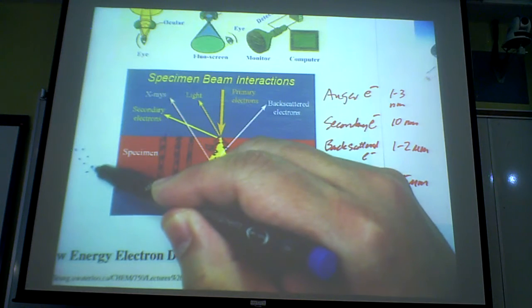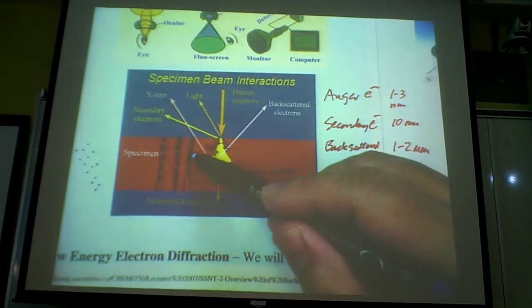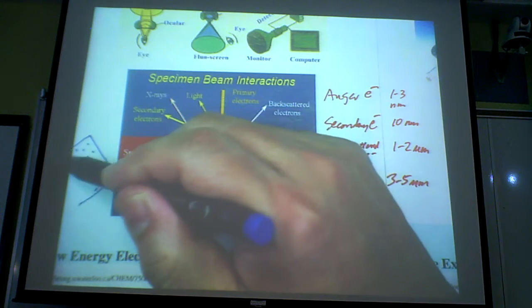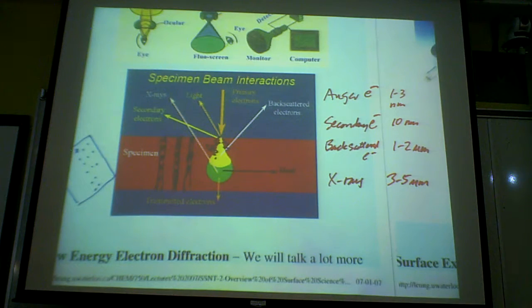I have a TEM picture that I'll bring next time to show you. You can see this column of atoms when you look down. But what you're seeing is really a projection of all these atoms lining up. So don't get too excited when you do TEM. You have to know its limitations, and know what it's telling you as you sample your data.